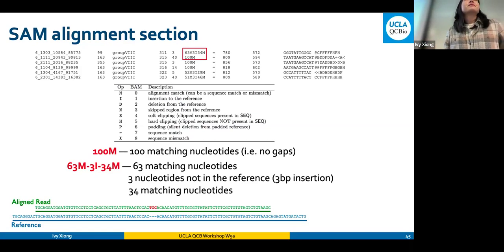So at what point should these variations be taken into consideration, like the quality of the read? Right, for mRNA it's less of a concern because we are only really looking into 3% of the genome, which is protein coding. But for a lot of other DNA sequence matching, it's very problematic.